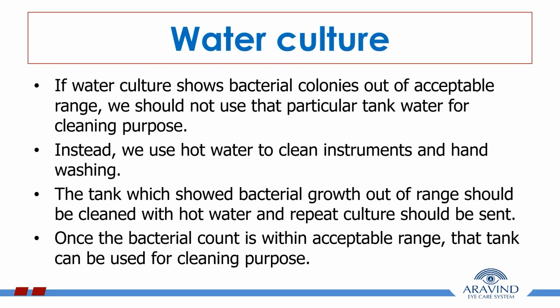Water culture. If water culture shows bacterial colonies out of acceptable range, we should not use that particular tank water for cleaning purpose. Instead, we use hot water to clean instruments and for hand washing. The tank which showed bacterial growth out of range should be cleaned with hot water and a repeat culture should be sent. Once the bacterial count is within acceptable range, the tank can be used for cleaning purpose.